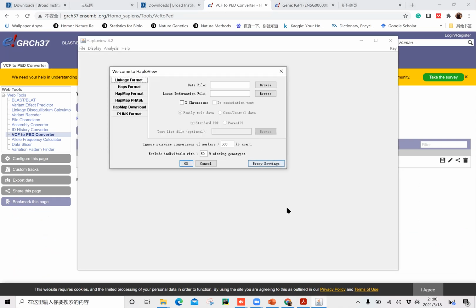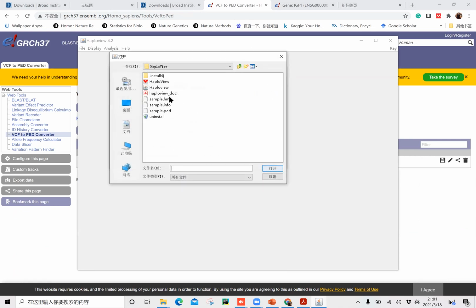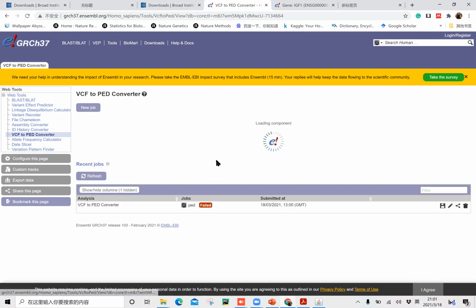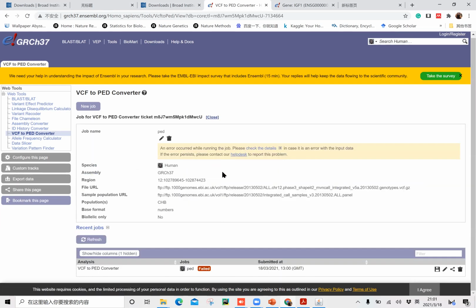It's okay. There is an example. When you download this file, there is an example here, and it's very simple. I don't know, I tried several times today. It failed, and then I checked the reason.